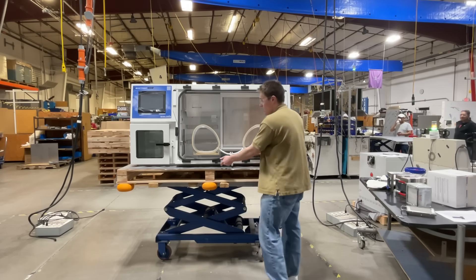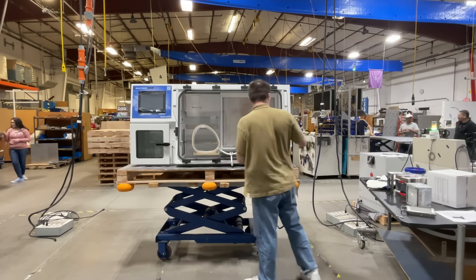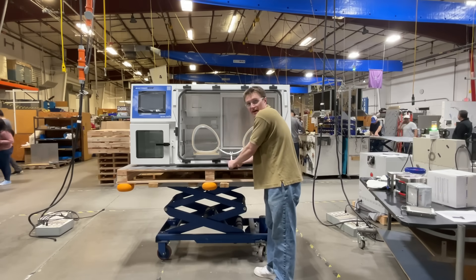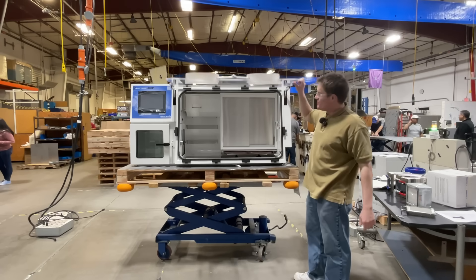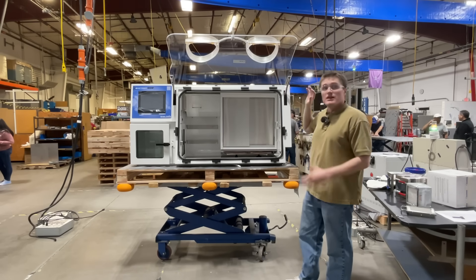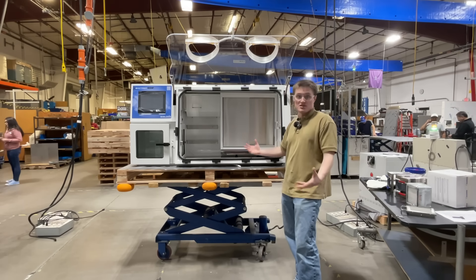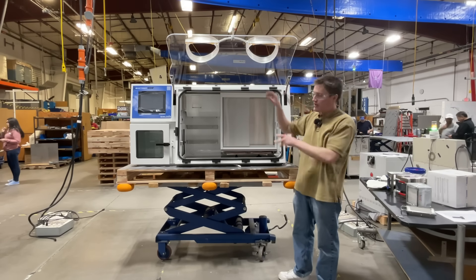Next, you need to undo each one of these 10 black tabs. Last, you disconnect the vacuum tube. Now it's ready to open. This flange allows ease of cleaning and ease of introduction of very large pieces of equipment that you want to have inside without having to completely remove the front flange.